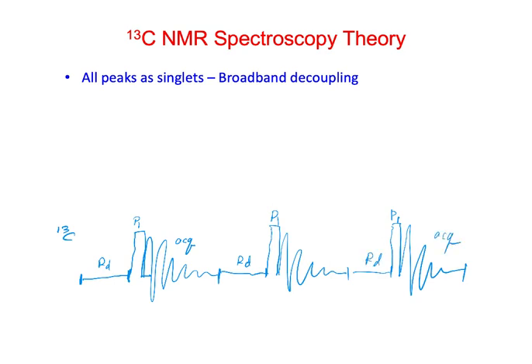Okay, so for decoupling, remember when we did the selective decoupling in the proton NMR, the main thing is that we have the decoupler on when we're doing acquisition. That's what removes the coupling. In this case, we're going to do what's called broadband decoupling rather than selective decoupling, in that we're going to be irradiating the full range of the protons.